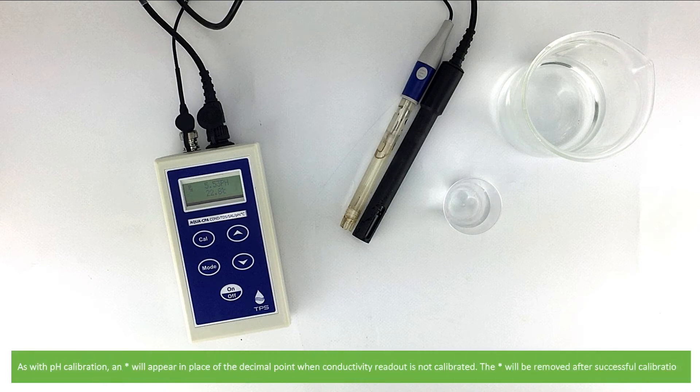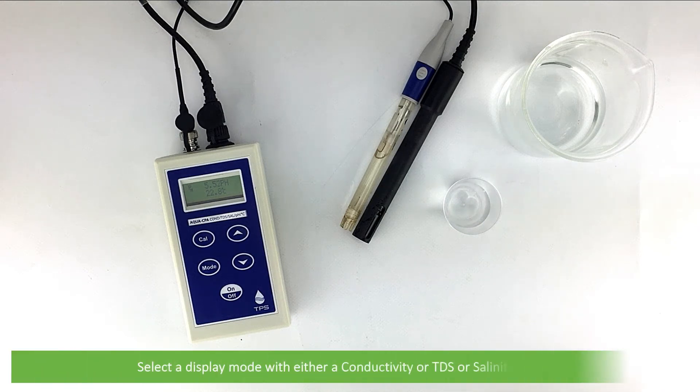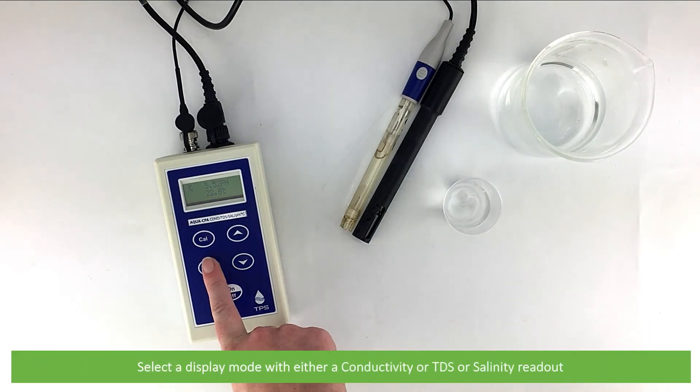As with pH calibration, an asterisk will appear in place of the decimal point when conductivity readout is not calibrated. This asterisk will be removed after successful calibration. Select a display mode with either a conductivity, TDS or salinity readout.